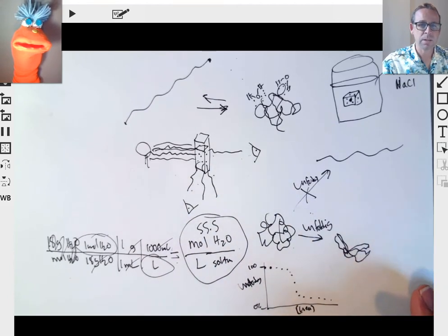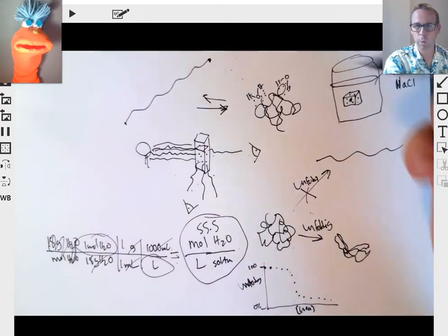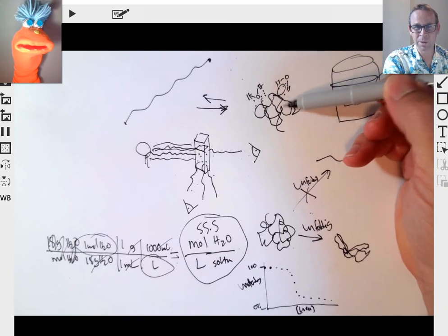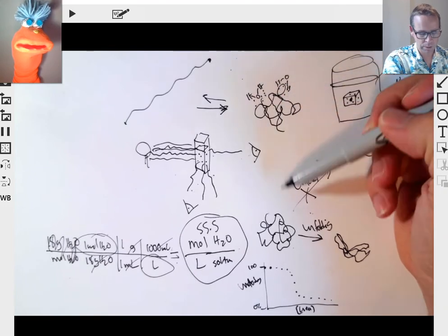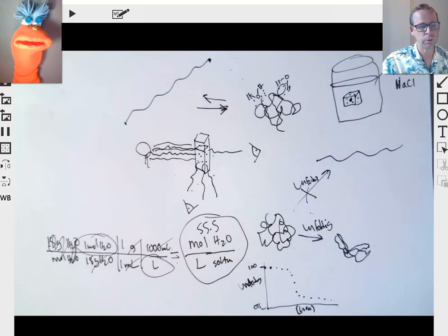But the point is, it happens kind of all at once, so it's cooperative, we say, because little parts become unstable, and then once the instability reaches a point, the whole thing collapses and unfolds. So the sigmoidal curve is a typical unfolding curve. Again, could be going up or could be going down. Typical unfolding curve for protein unfolding.